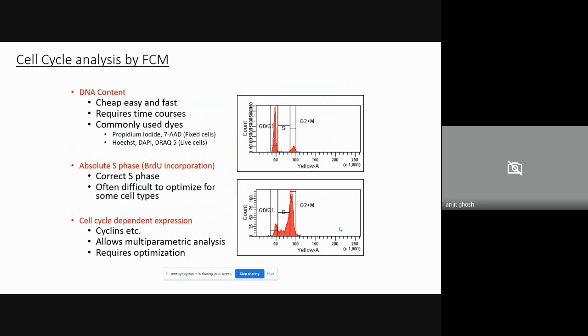This is done with a dye called PI, which binds to DNA and nucleic acid content. It also binds with RNA, so when staining with PI, you need to eliminate the RNA with RNase enzyme. With cell cycle analysis, you can detect if a drug you're working with can induce cell cycle arrest at any of the checkpoints.